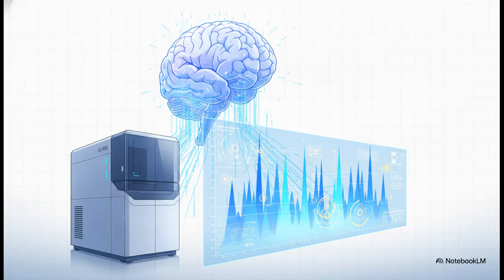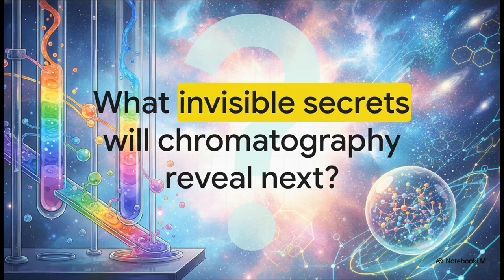Modern chromatography systems are already incredibly automated, but by bringing AI into the mix, we can actually mathematically predict retention times before the physical race even starts. And when we combine liquid chromatography with mass spectrometry, a technique known as LC-MS, AI can rapidly analyze these mind-bogglingly complex datasets, identifying compounds with a level of accuracy and speed that was, frankly, completely unimaginable just a few decades ago. We really have come a remarkably long way from just separating green pigments in a leaf, haven't we?